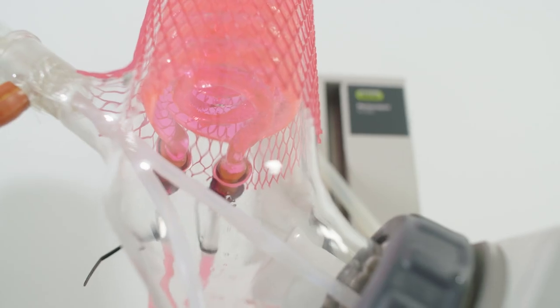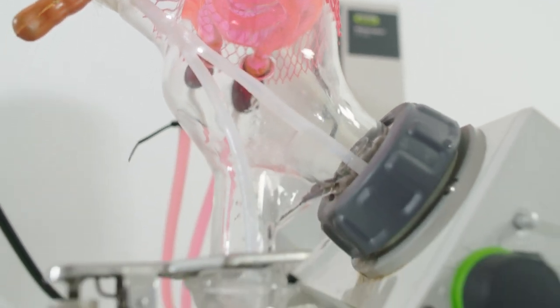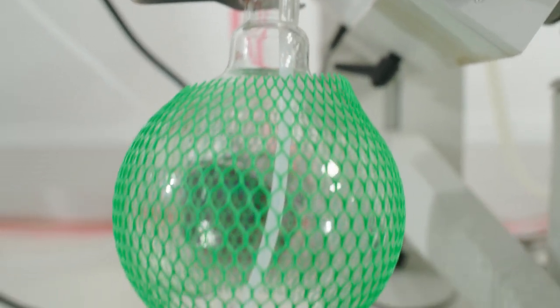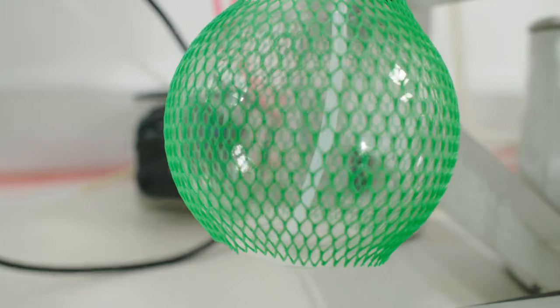It might be a year or two years later when that same client gets in touch and says, 'Could we have a quote please for 50 grams chiral separation?' We'll look back and see it was on this tiny scale, so it will have gone for initial testing and proved to show some potential.